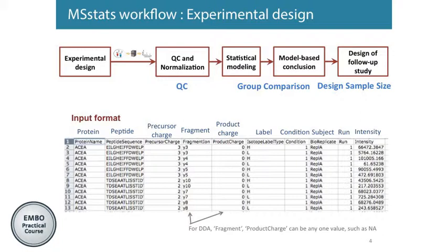And what type of experiment you will do, like DDA or SRM or whatever, and how many samples you can take. Then you need to consider blocked, randomized design, which was discussed in the morning section. Then you set up the design, do the sampling, and process all the sample preparation, then measure, and finally you get some numbers. At this point you're ready to do statistical analysis. So this is the starting point for MSstats.